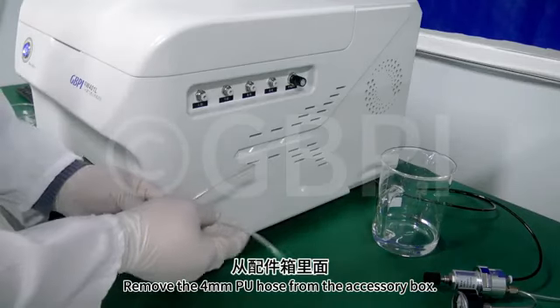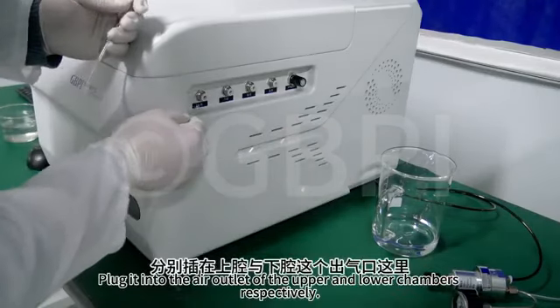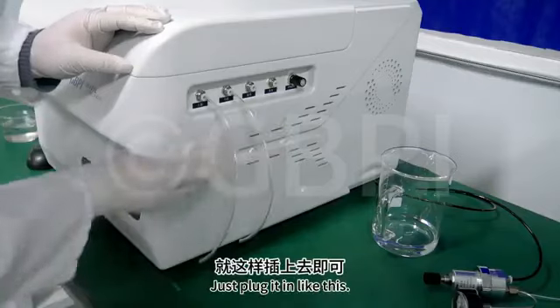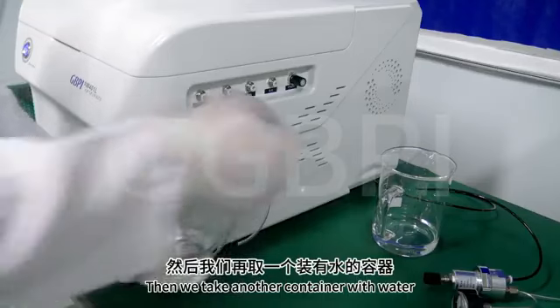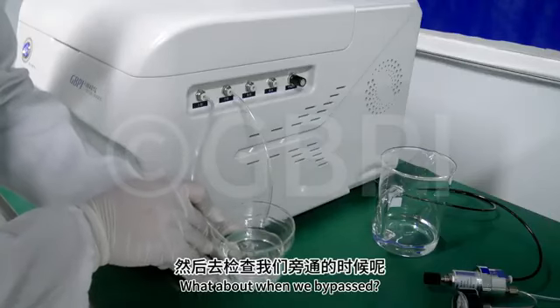Remove the 4mm PU hose from the accessory box. Plug it into the air outlet of the upper and lower chambers respectively. Just plug it in like this. Then we take another container with water. Then go check.